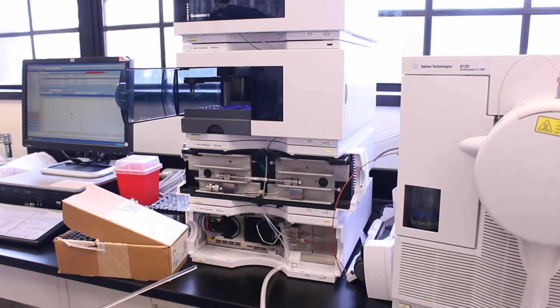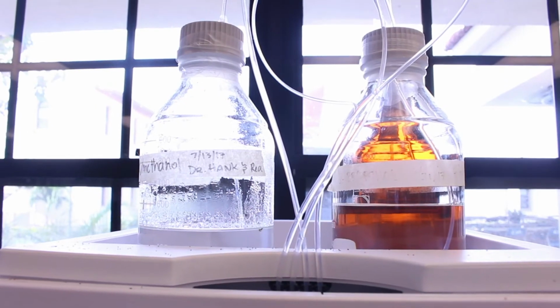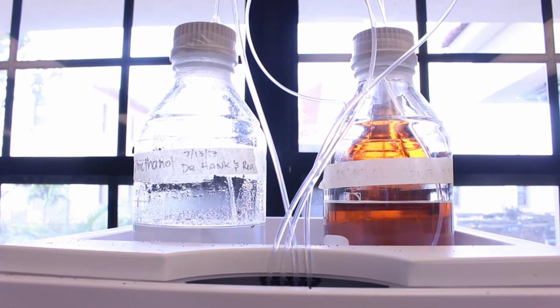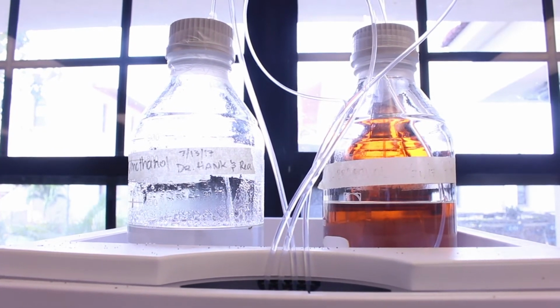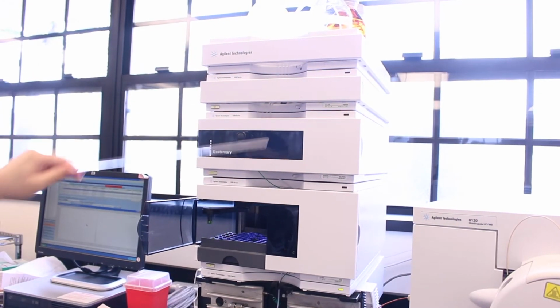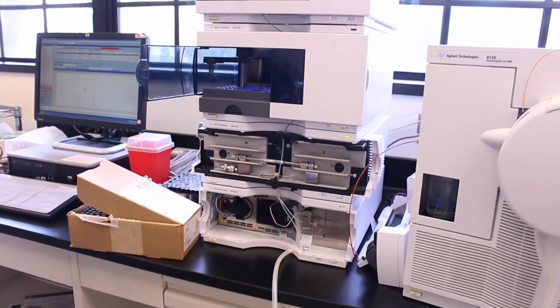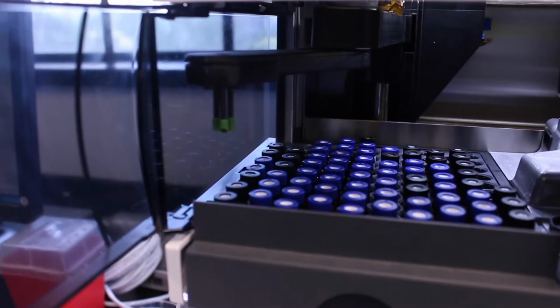In this case, we're using liquids. On top here, you'll see some aqueous solutions. There's water and methanol and perhaps acetonitrile. And these liquids are pumped through the system. Up here is a pump, and that pump is going to push a mixture through a column. This here is the injector. There's a little robot arm that picks up the sample.